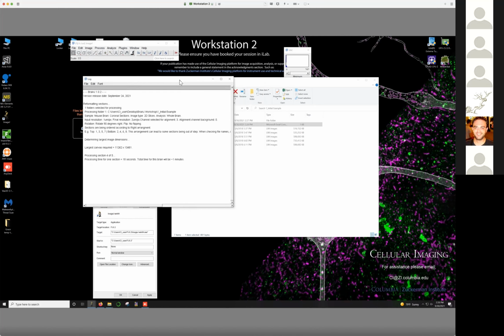Does anyone have any questions so far? Hey, Luke, I have a question actually. Let's say that we know that it's working nicely, we test probably on a few slides, and we want to run it on the entire big folder with a lot of images. Can I just set it up in a way that runs in the background, or do I need to leave the computer working on it?